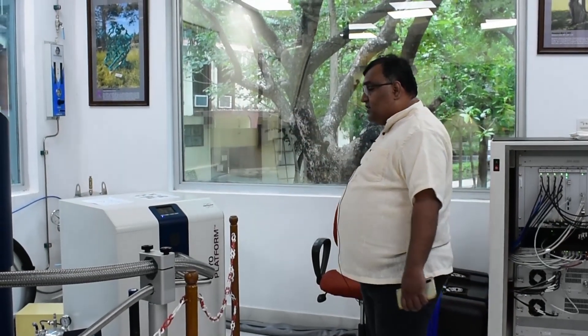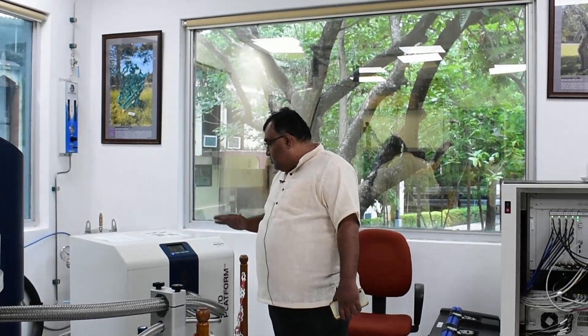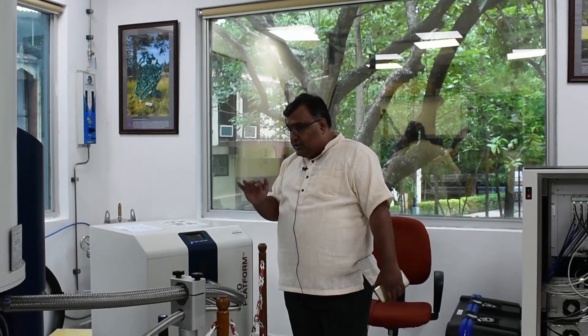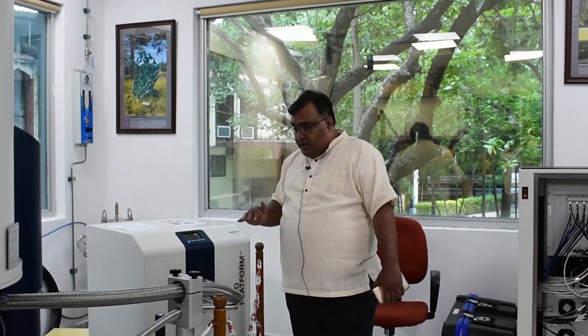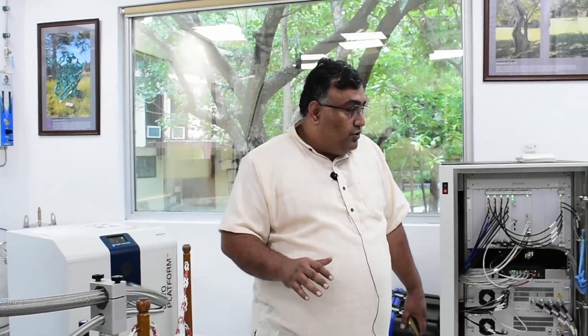So this is in equilibrium right now. All of this setup requires uninterrupted air supply, uninterrupted power supply and very close monitoring. Because any small changes that occur in this can lead into a catastrophic failure of one or many components in the system.